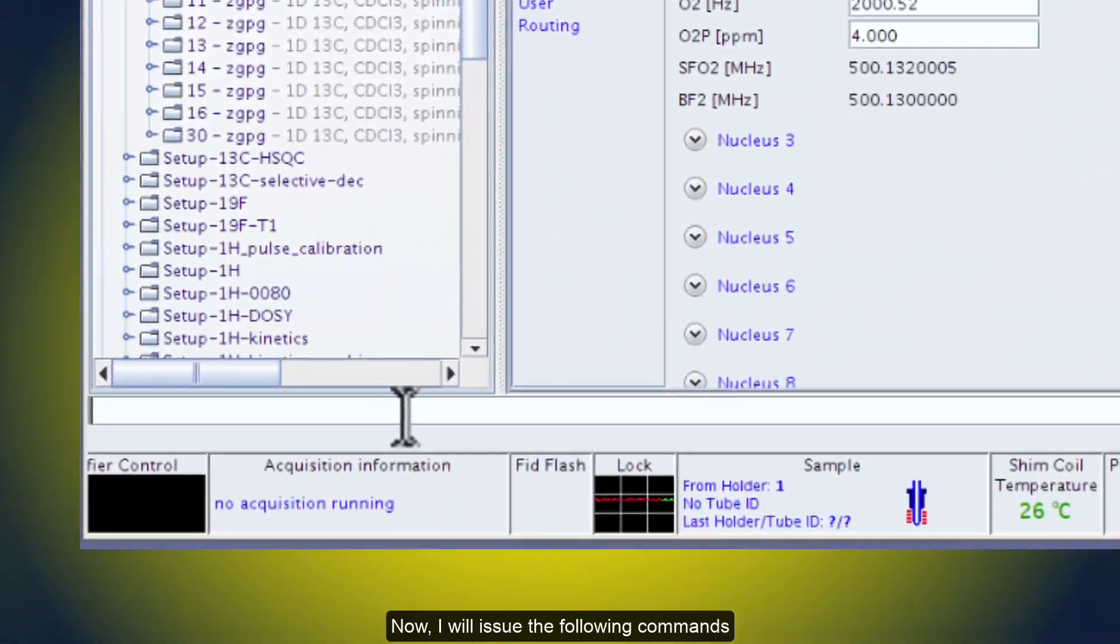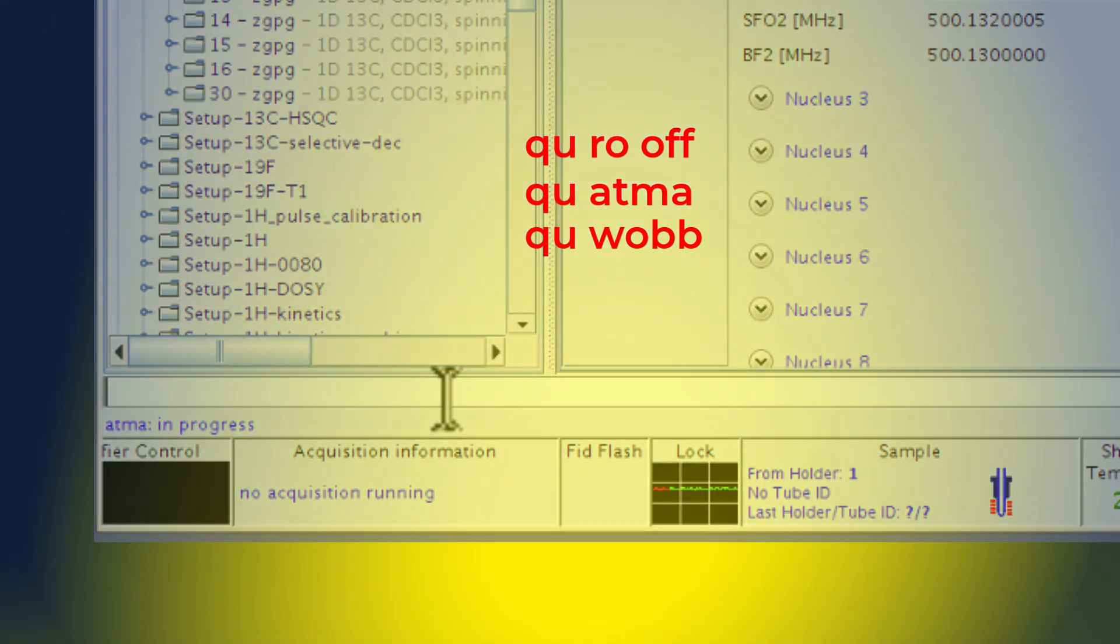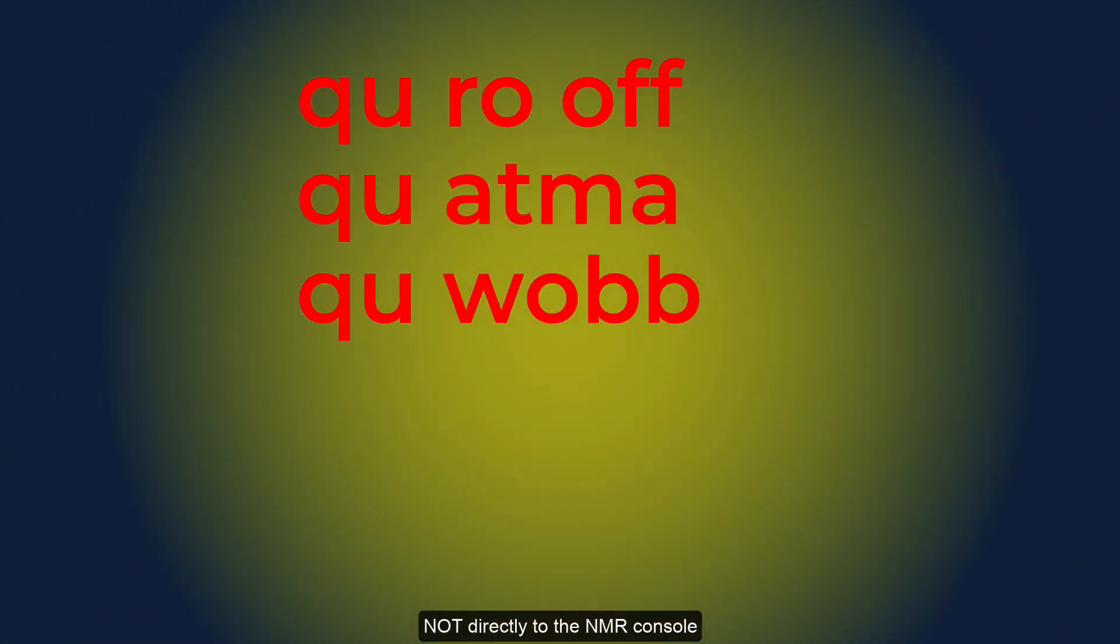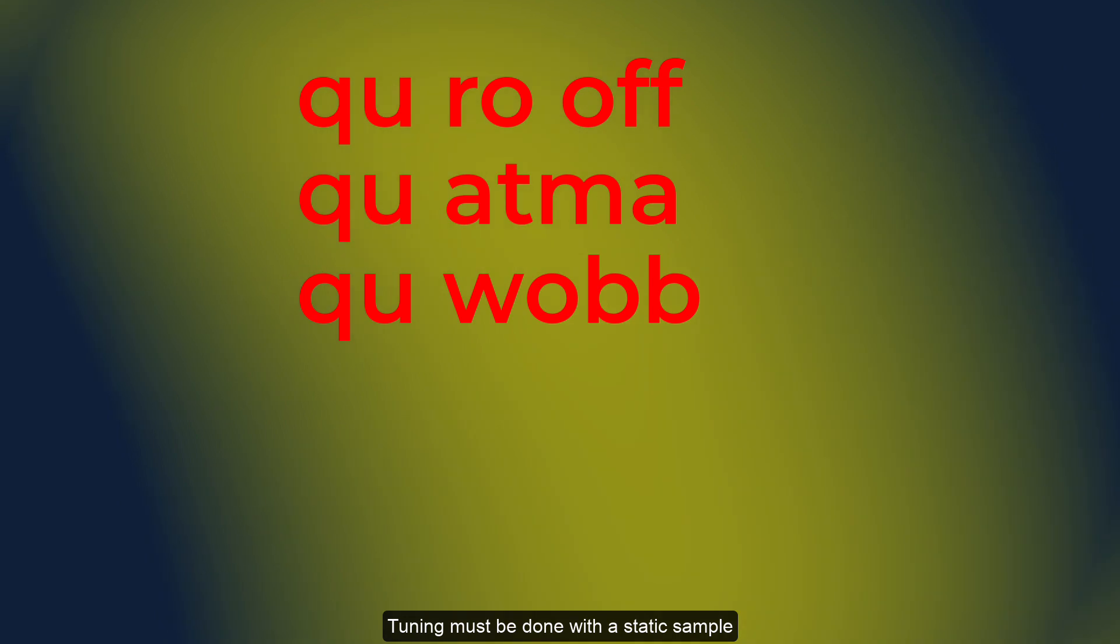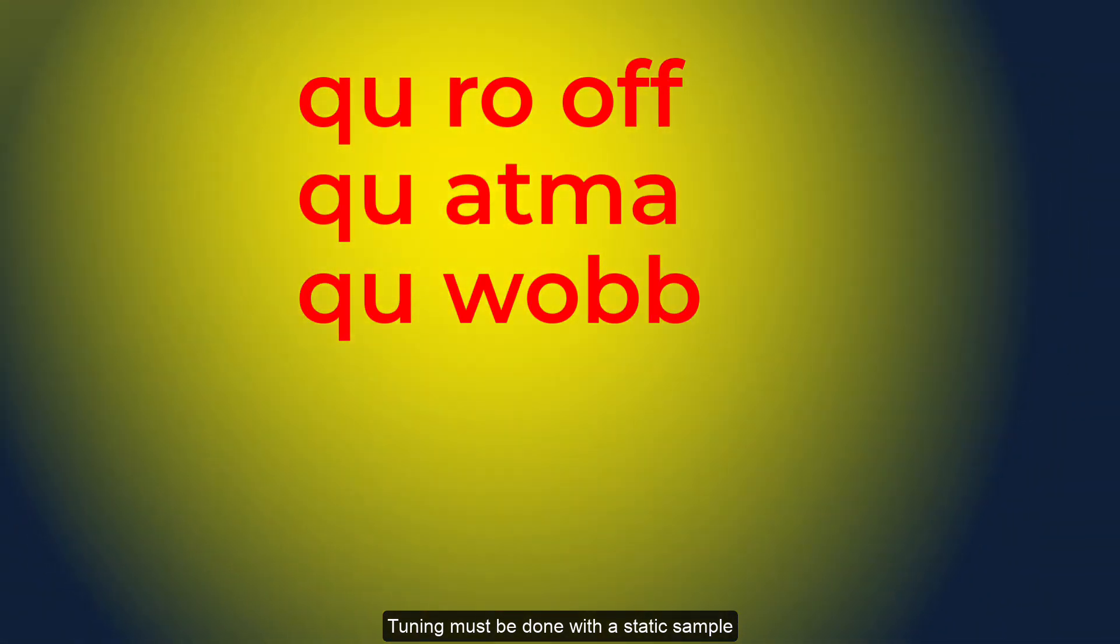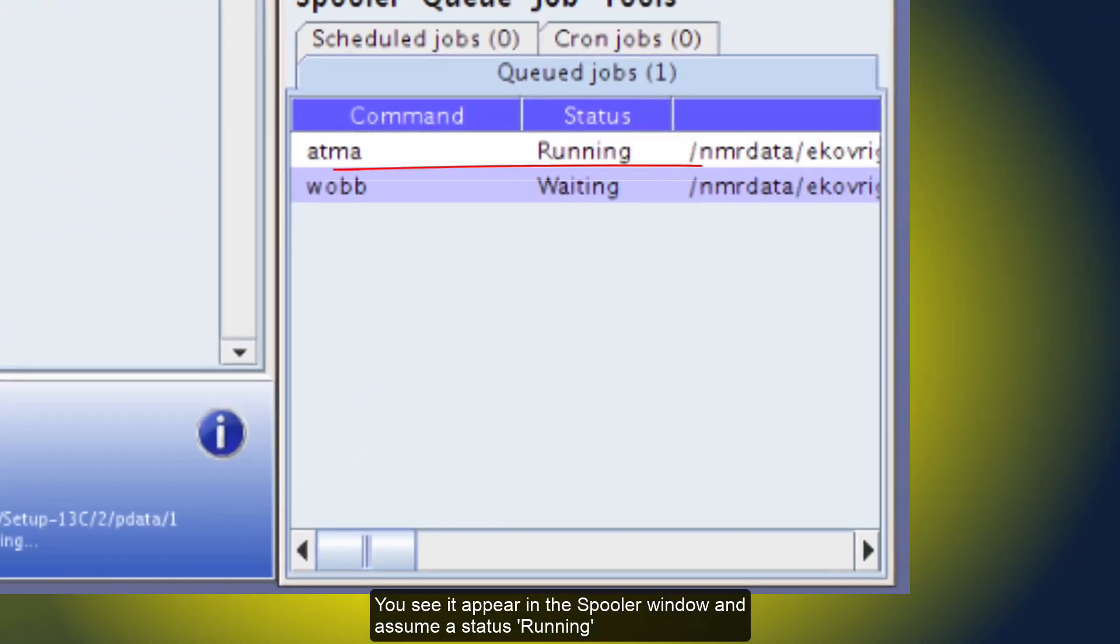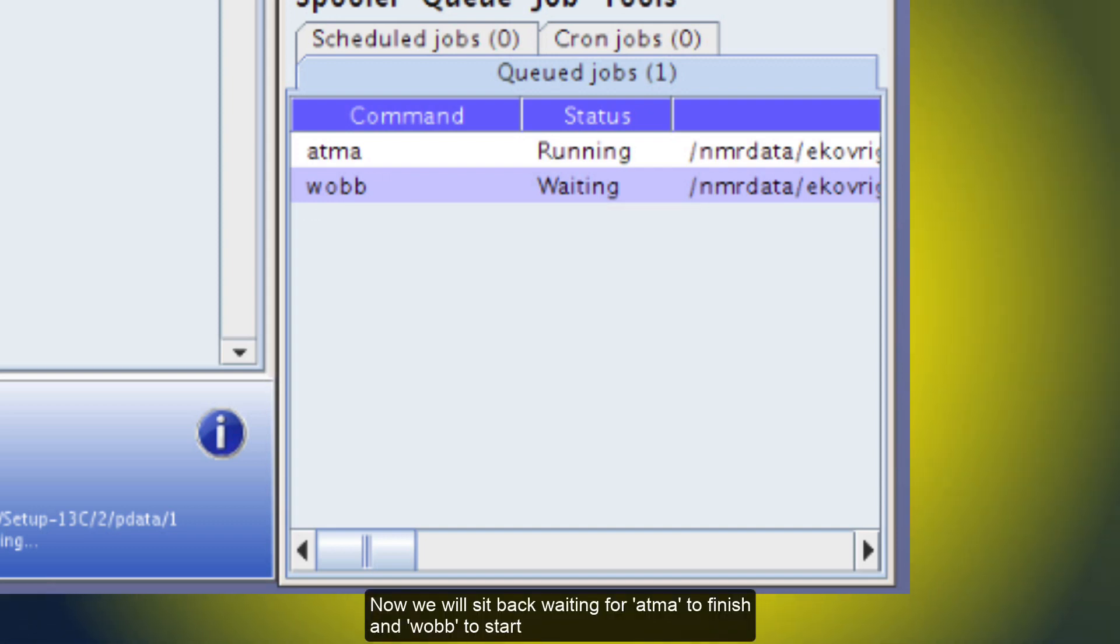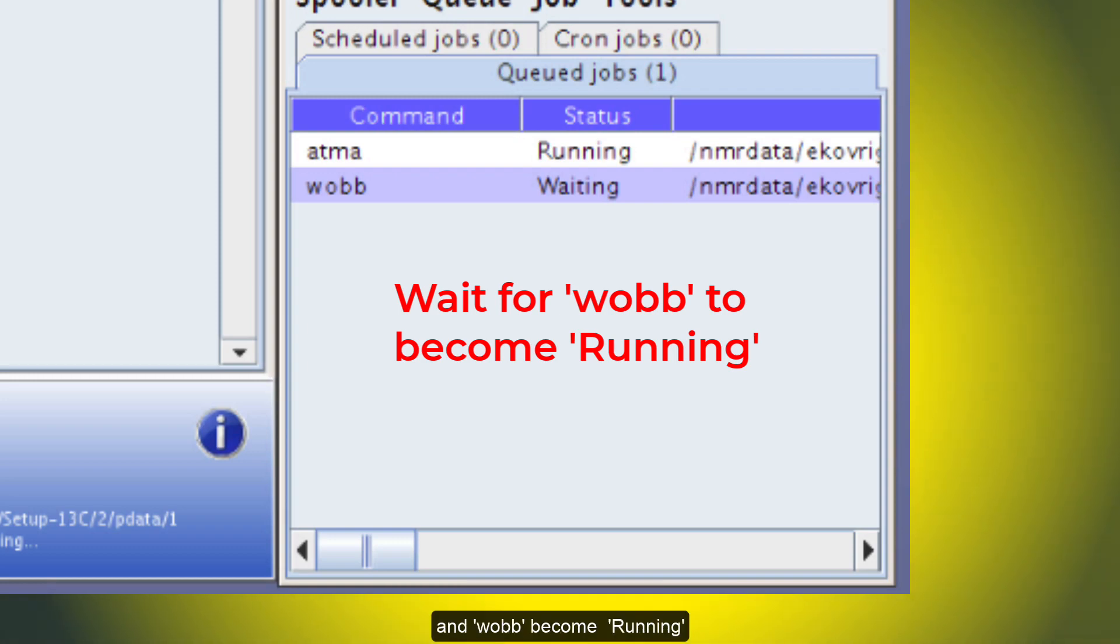Now I will issue the following commands: Q-RO-OFF, Q-ATMA, and Q-WOB. The preceding Q-U indicates that you are sending this command to the spooler, not directly to the NMR console. The first command will ensure that your sample is not spinning. Tuning must be done with the static sample. The second one calls for automatic tuning and matching procedure. You see it appear in the spooler window and assume a status running. The third one is a command that will help us verify how well the tuning job was done. Now we will sit back, waiting for ATMA to finish and Wob to start. We should see ATMA disappear from the spooler list and Wob become running.